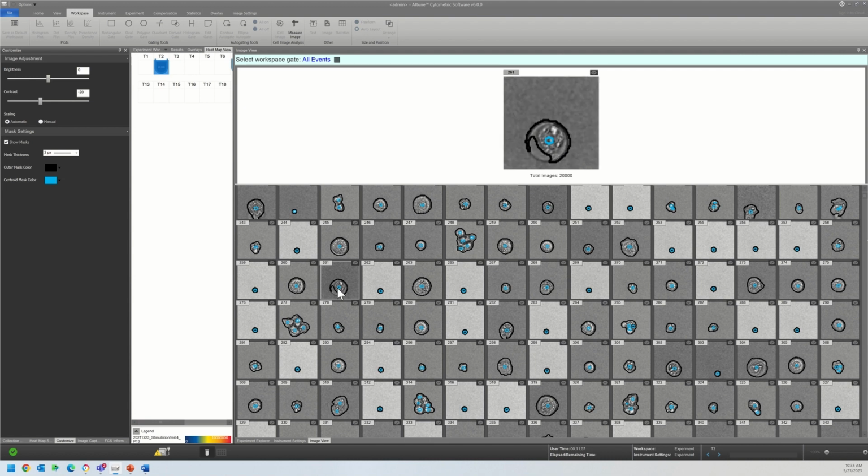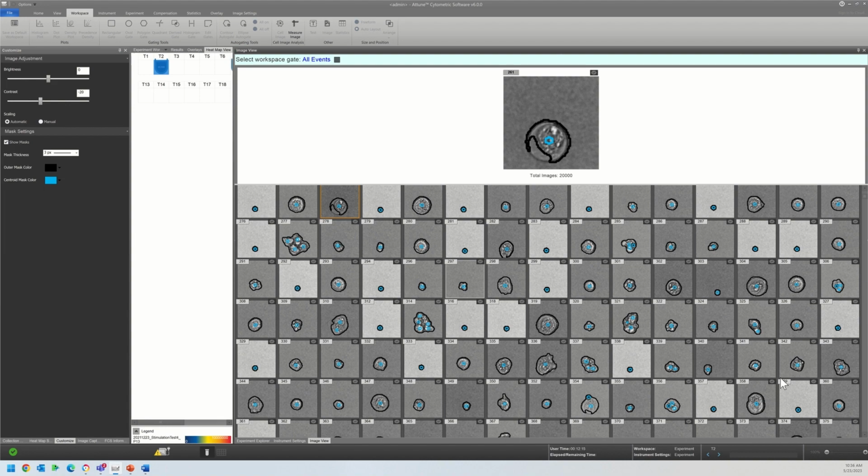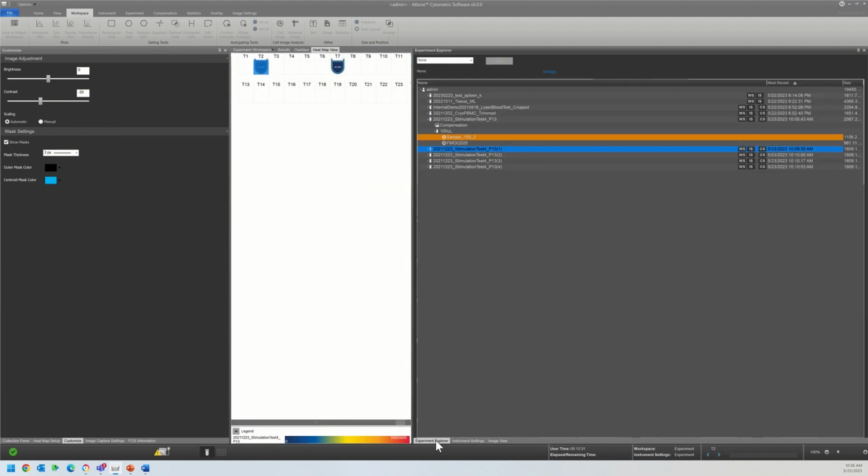For something like this, where we see that there is this lighter blebbing starting to occur, we did not include blebs in part of this model, so these look essentially normal. To me, this looks very, very well annotated considering how messy the sample is. So I have no concerns about these annotations.